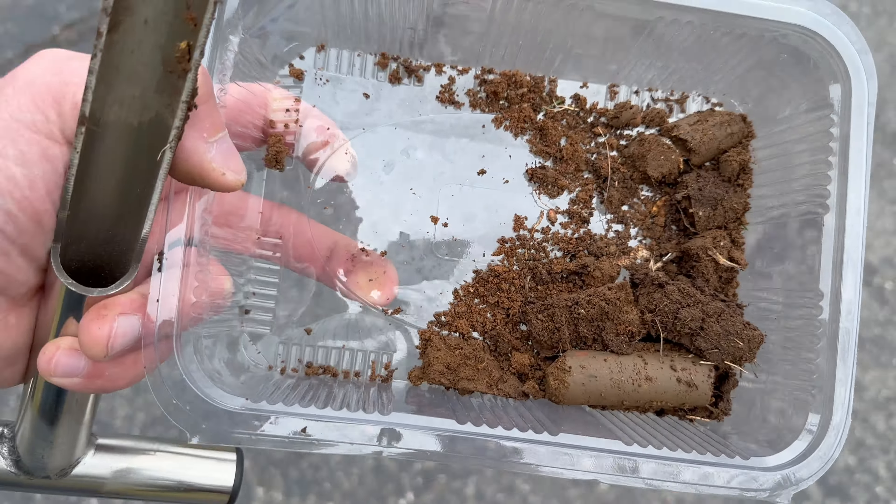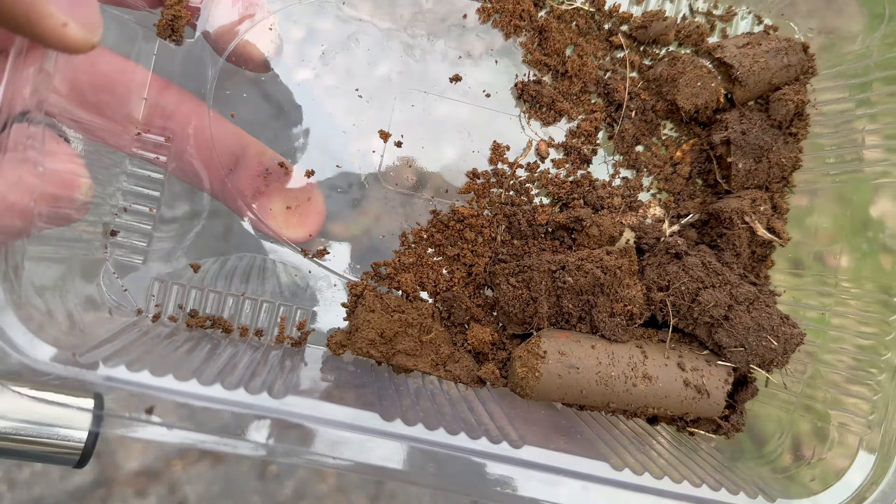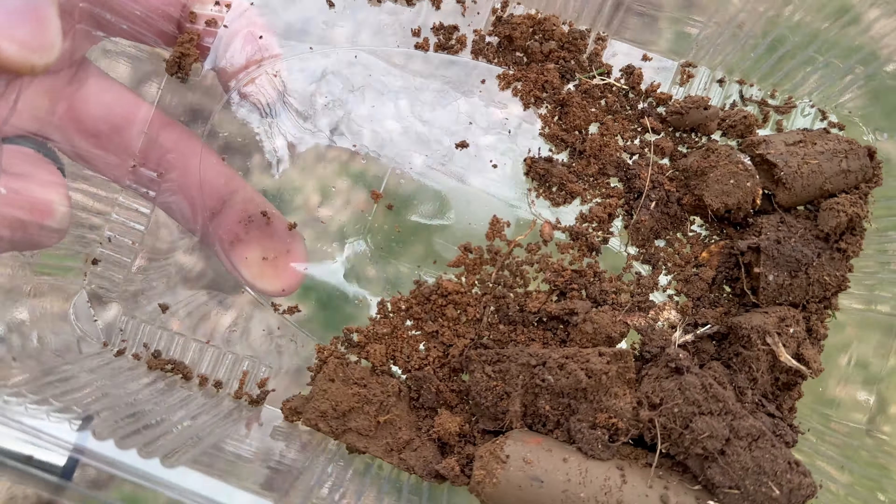So I got three already — this is what it looks like. What we'll do is pull out any rocks, debris, or grass, mix all this up together really nice, and then we'll take a sample from this.